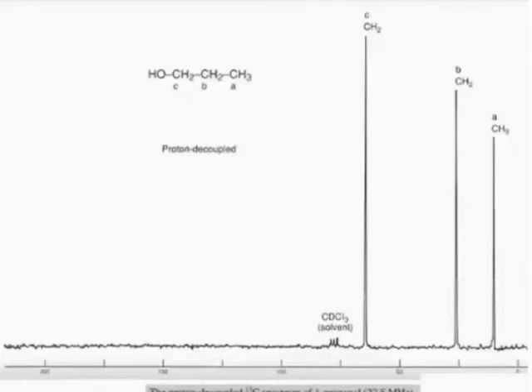Now, interestingly, in this one, you would normally see a TMS. For some reason it's not showing here in this example, but normally you'd see a peak right here for the TMS standard. That is, the C13 NMR would show a signal which would be set at 0, just like was done for proton NMR. The solvent that's typically used in C13 is deuterochloroform. Now, because decoupling has been carried out, again you see 3 narrow sharp singlets, one for each carbon.